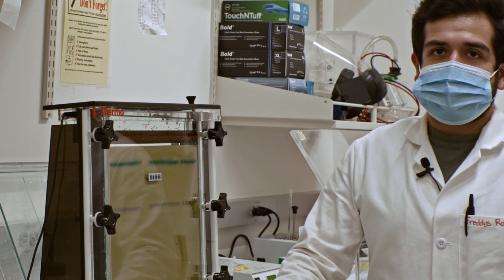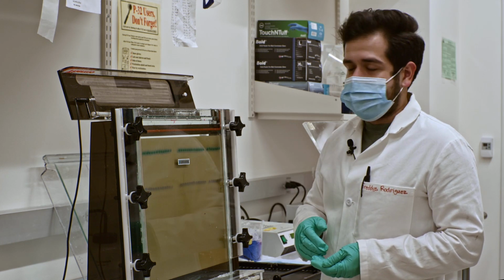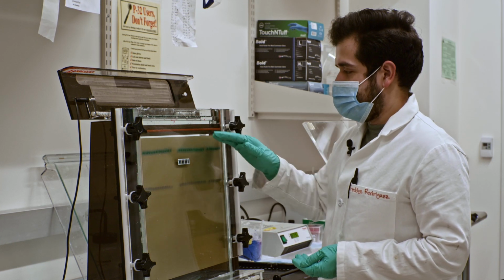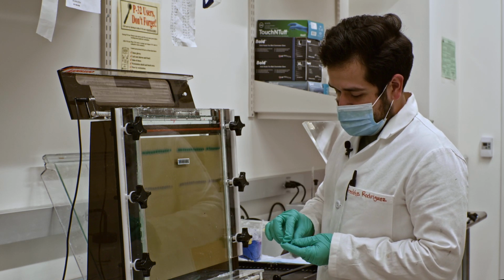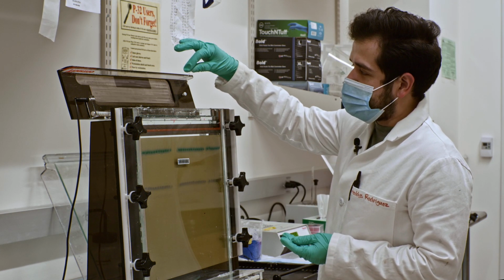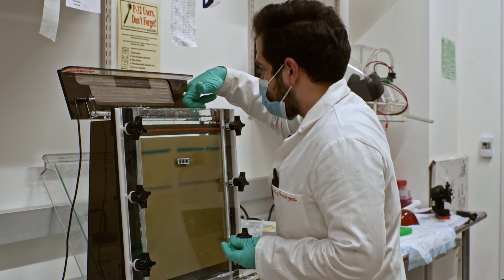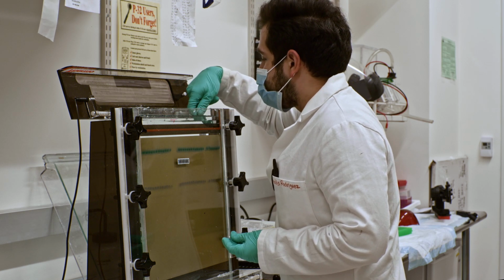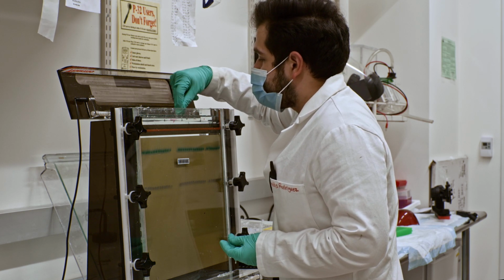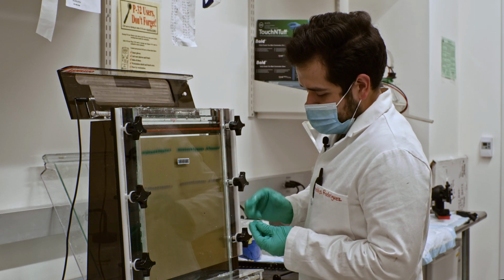I actually noticed something was happening with the drain in the back. It wasn't draining properly, and so I decided to open the top of the gel box prior to complete emptying of the compartment. Sometimes whenever you take off the comb, they have little pieces of gel that are hanging around. If you notice that your system is not draining effectively, you might want to just open it up and see if there's anything clogging the drain, which in this case, there's still a few pieces of gel left up in there from when I took the comb off, and that should fix your issue.